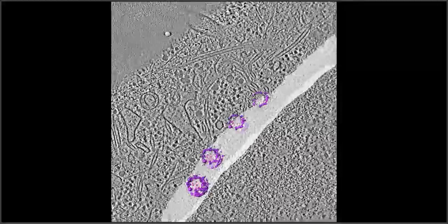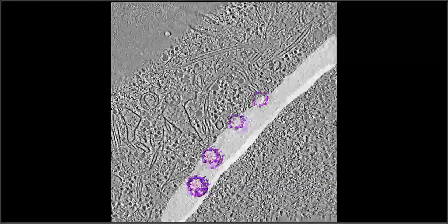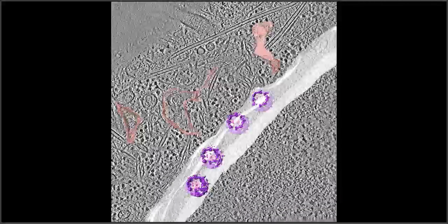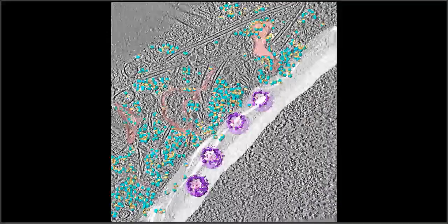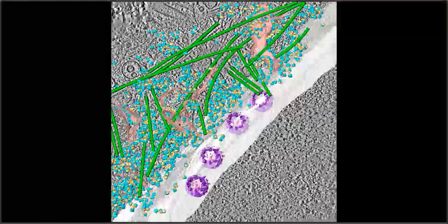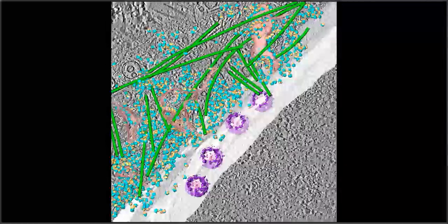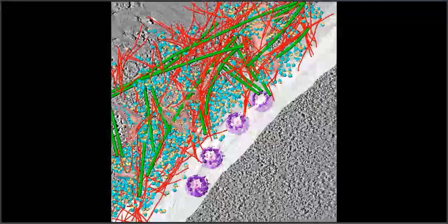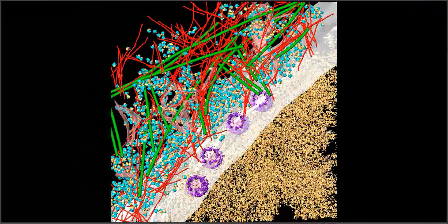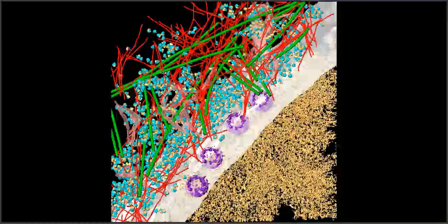And so, Dwight, in contrast to the previous image, here there's no metal coating and this sample is actually frozen in its natural liquid state. Indeed. And so we've actually found a spot in the cell where we've used an ion beam or a laser to basically blade away the surface to get thin enough for the electron beam to go through. And now we're imaging really material that is diffracting the electrons based on the carbon, nitrogen, oxygen that are the biological molecules. So what we're seeing is the true biological material.